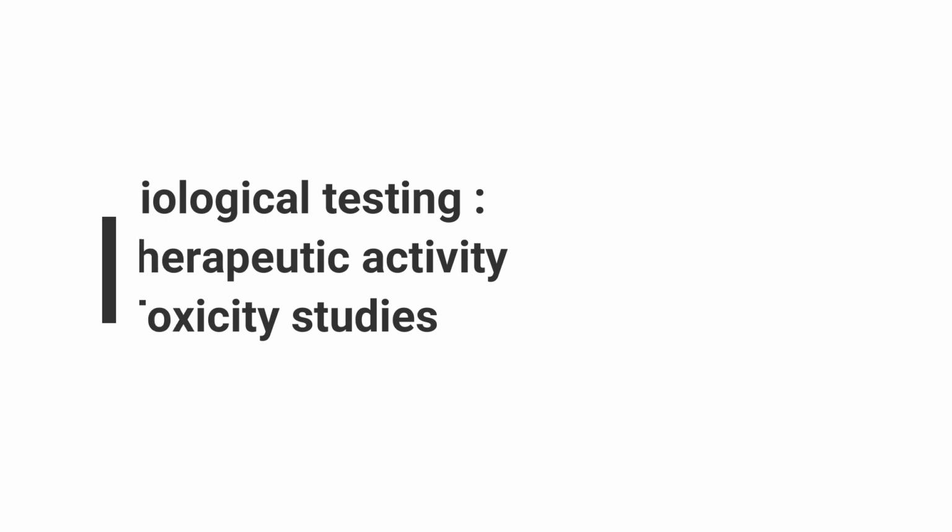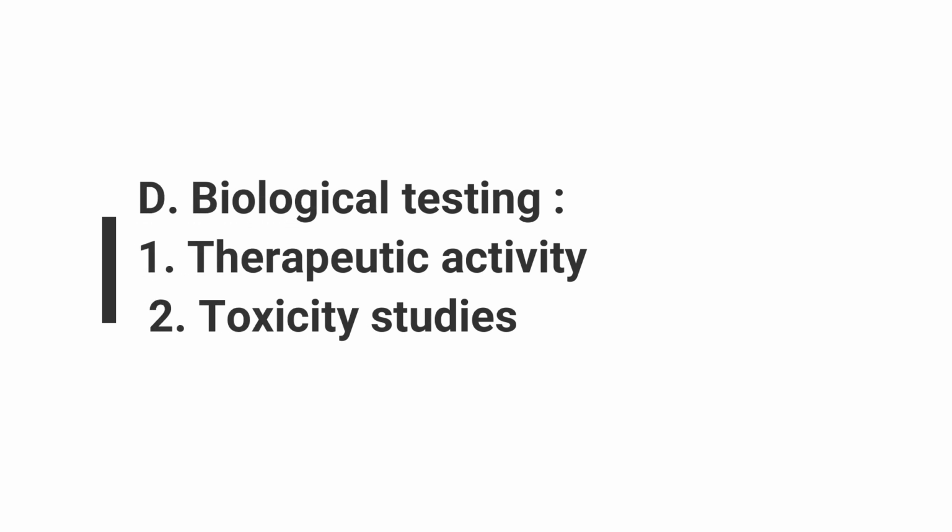The final one, biological testing. Here two tests are conducted: therapeutic activity and toxicity. First, therapeutic activity. For inhalation aerosols, the dosage of the product is determined and related to the particle size distribution. For topical aerosols, it is applied to test areas and absorption of the therapeutic ingredient is determined.